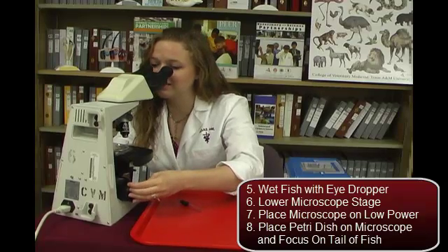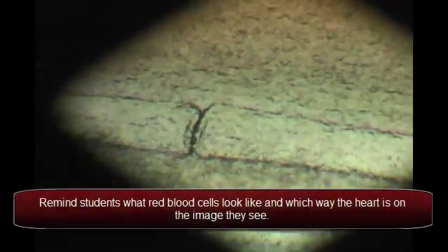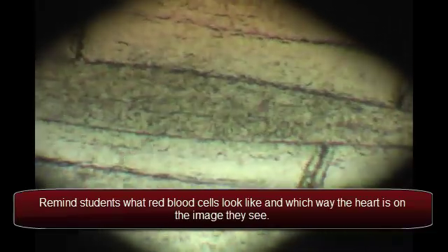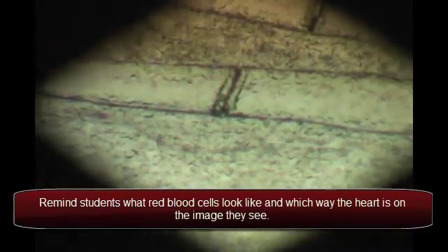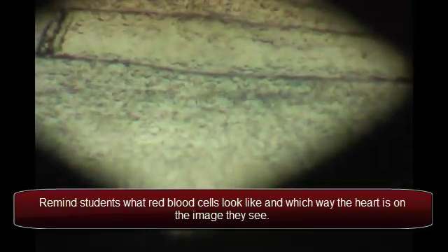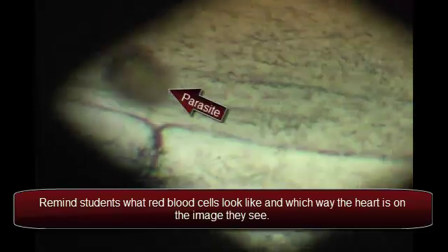Now we can see the small blood vessels and the blood running through them. Keep in mind that you may think the scales are actually the blood cells, but the blood cells are a lot smaller, really tiny. Also remember that a microscope flips the image, so what looks like it's going toward the fish's head is actually going toward the tail.